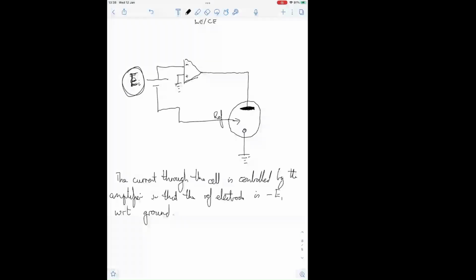And one of the rules of electrochemistry that is written down but people don't understand is that the counter electrode should be 10 times bigger in area than the working. So you should use a platinum mesh because it's a high area electrode.